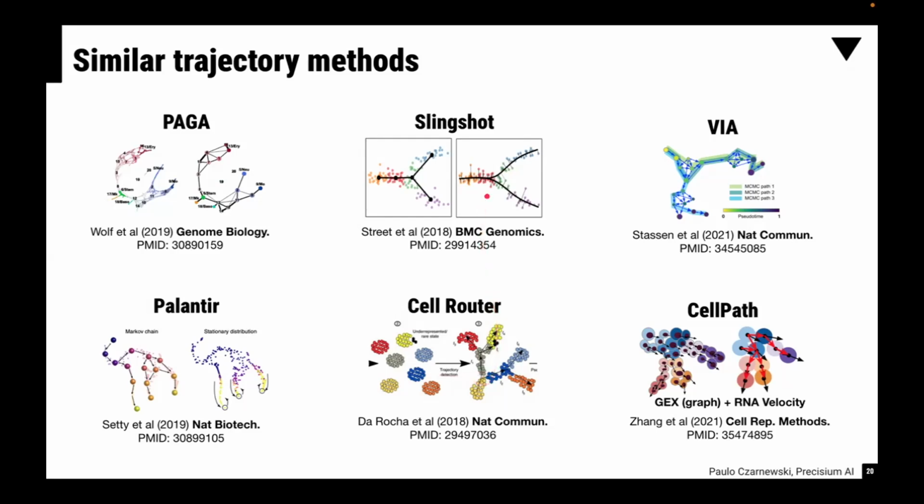So for trajectories, what I would recommend is always to try to do over-clustering. Sometimes when you do clustering by itself, you might get a lot of these cells in one big cluster, and then you won't see these very tight differences, the gradient differences. Of course, when you over-cluster, you don't see much difference between a cluster and the one before, because they are still very close. But for trajectory that is actually good. You do the general clustering just to see this cell type and that cell type, and then you see that there are some transitional cells in between.